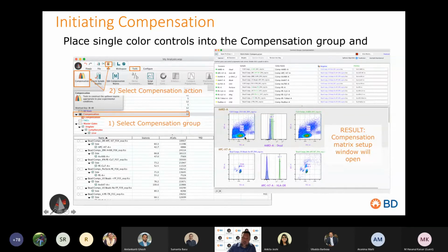And so it'll auto-gate usually on your lymphocytes if it's a cell comp, or on the major population of beads if you've stained beads for bead comps. And then it'll auto-gate on the positive fraction within that subset, right? So size gated, and then the auto-gating for the positive fraction within the size gated events here. And so you'll see these gates appear downstream of each of your compensation controls automatically.